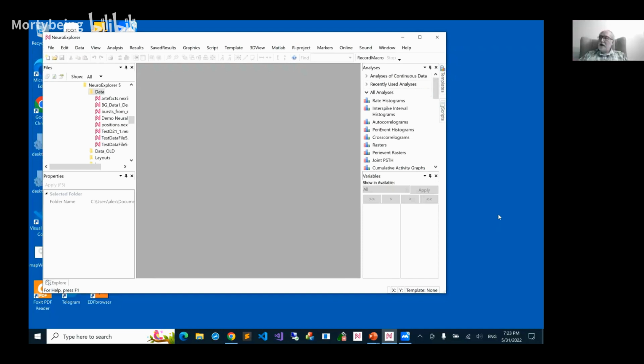Yes, my current Alpha Map support uses some protocol that your engineers sent me a long time ago. So with Alpha RS, it's much easier because it's just an SDK. It's a library that I call and it gives me all the results. But in any case, if you need it for a specific set of customers, I can always add, within some time frame like a month or two, support for online analysis for other Alpha Omega systems. Okay, got you. Thank you.